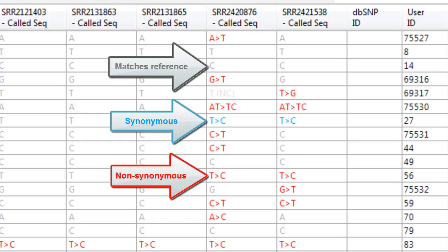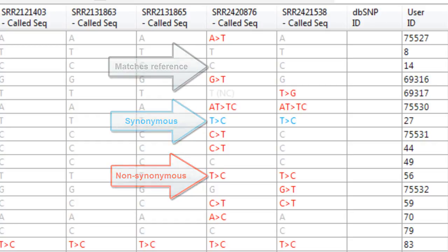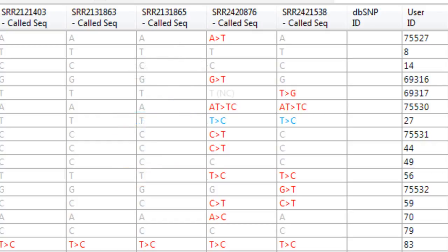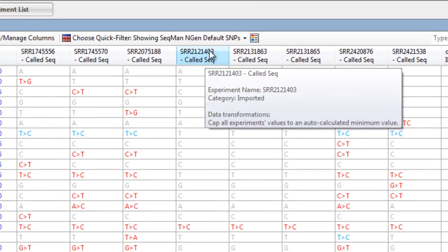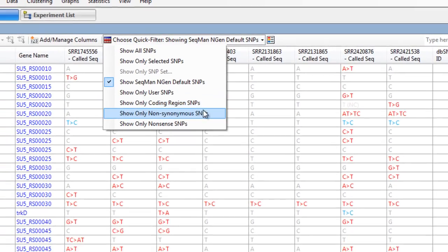You can easily modify what SNPs are displayed here, using the Quick Filter options at the top of the window.